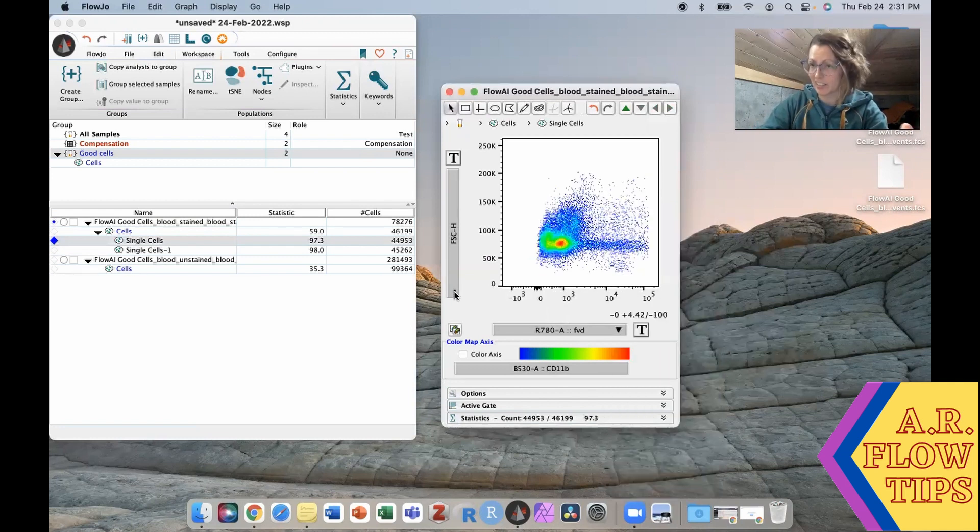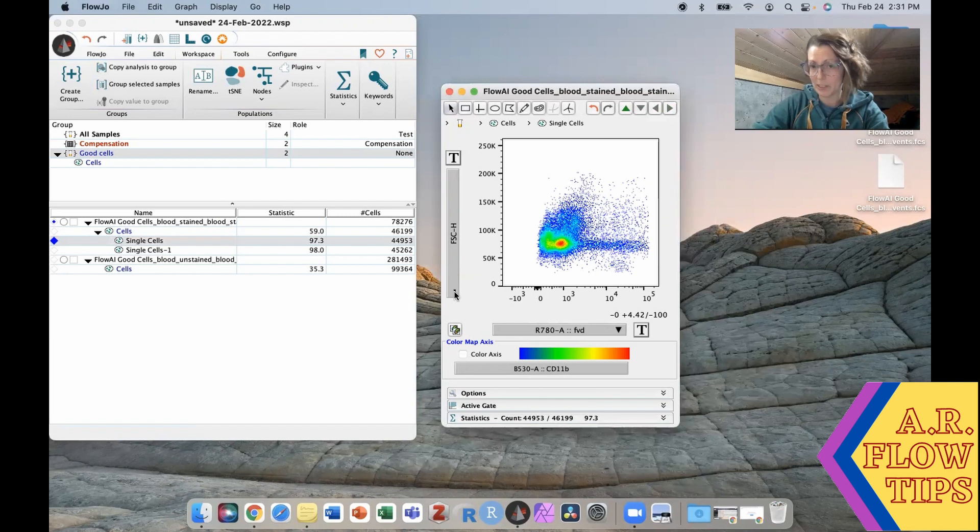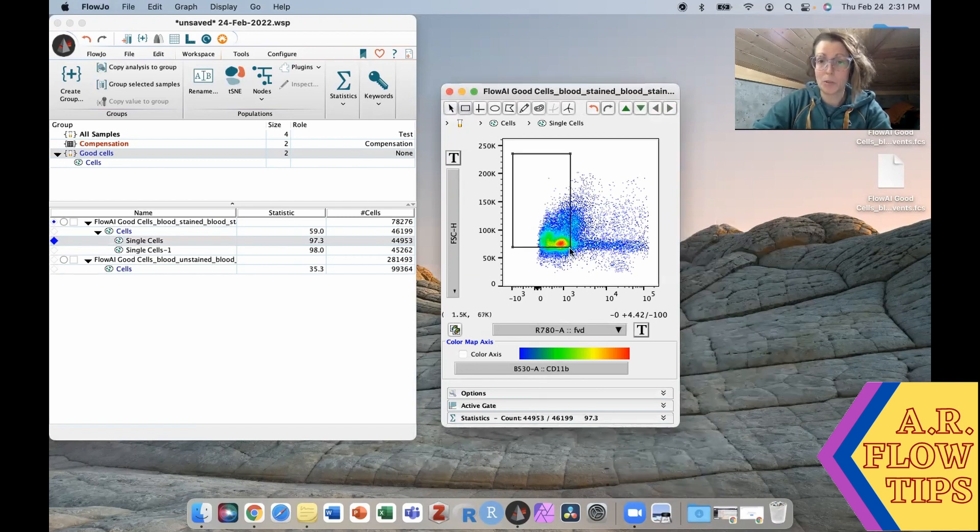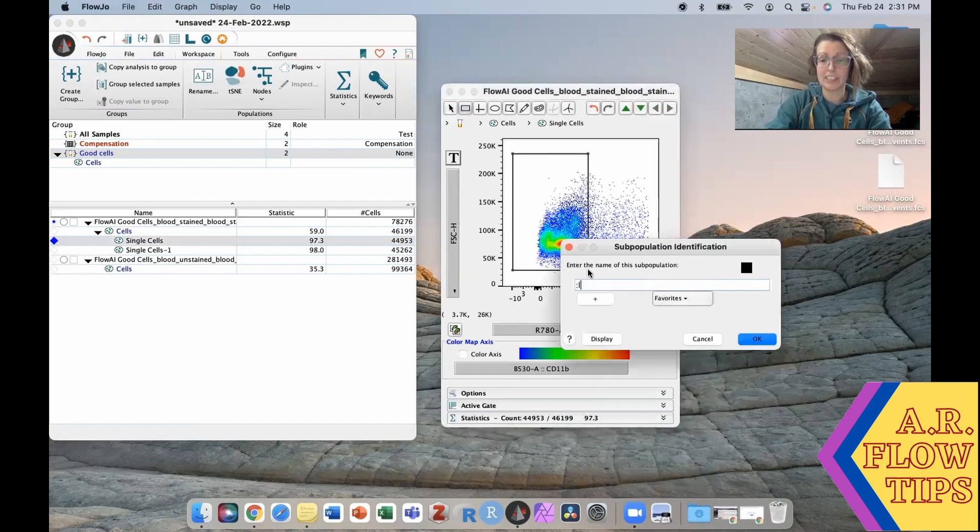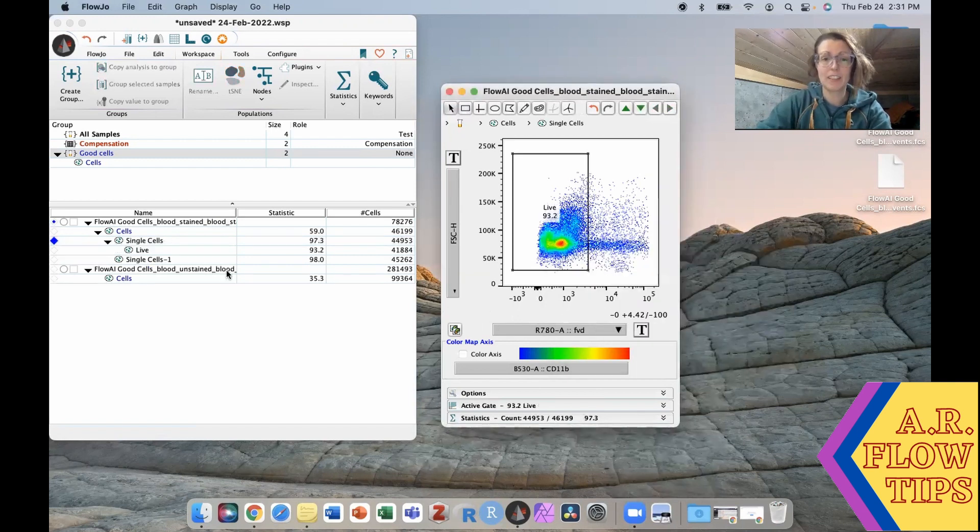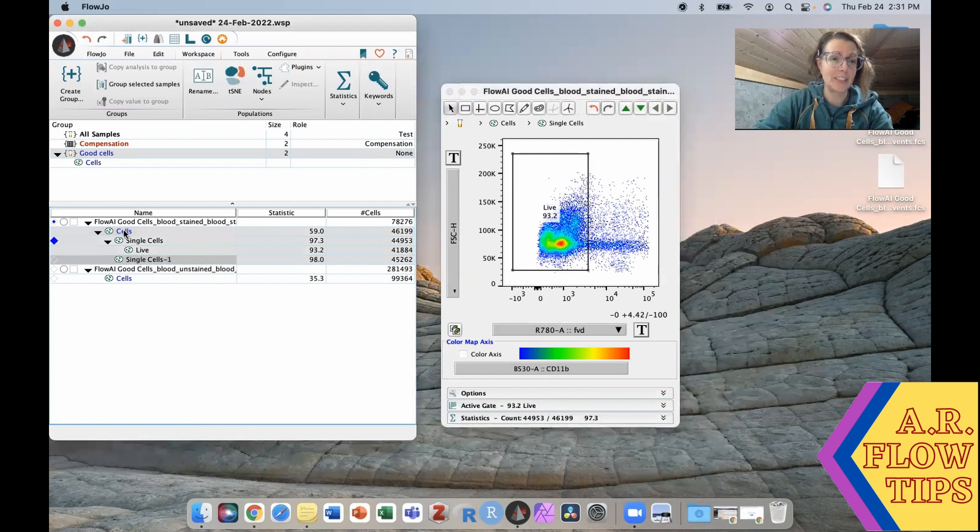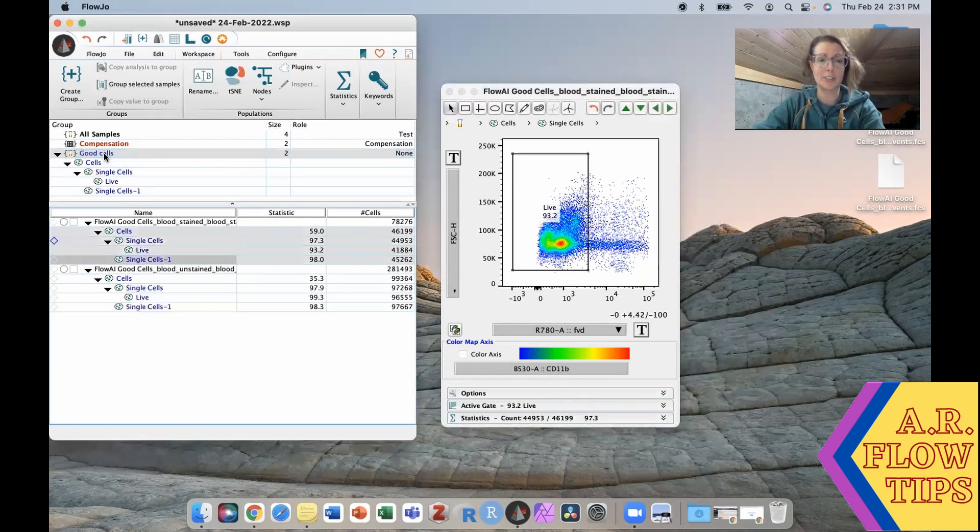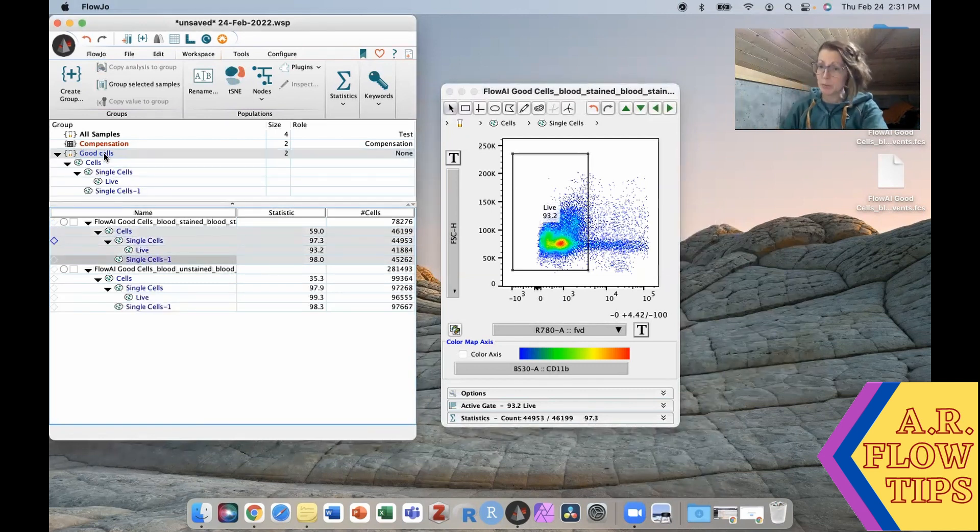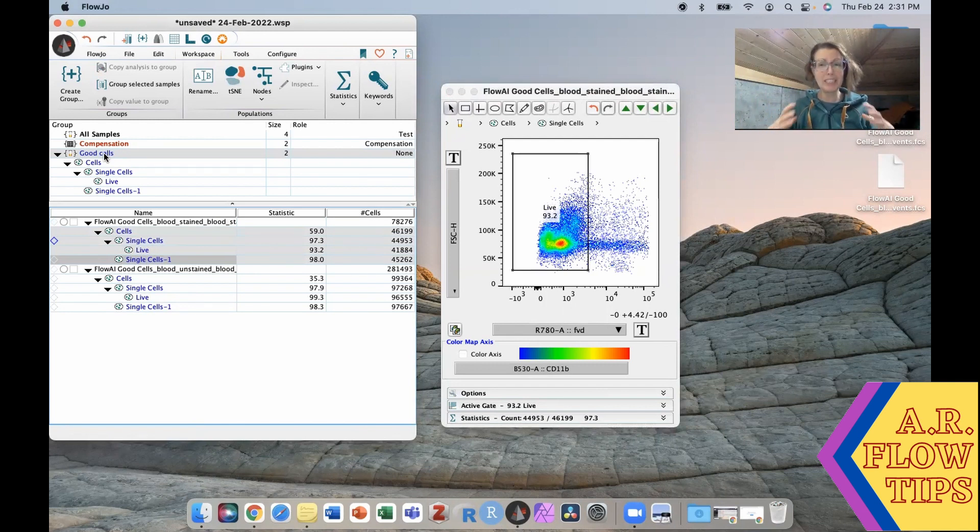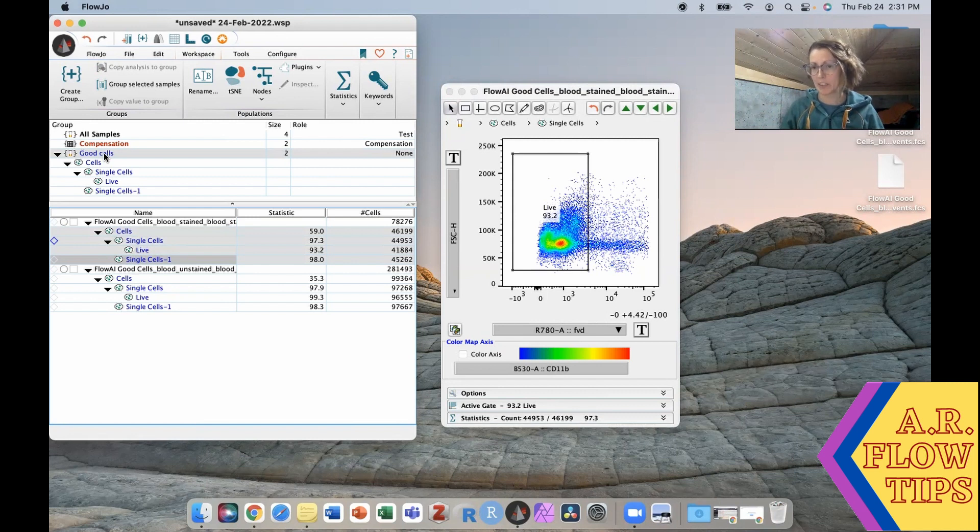So to do that we're going to select our fixable viability dye. Again doesn't matter what you put on this axis. We have our live cells, we have our dead cells and we're going to gate our live cells. And in this way we can then transfer this whole gating strategy onto both samples and continue on gating our experiment as we would, working with then a really nice clean data sample.